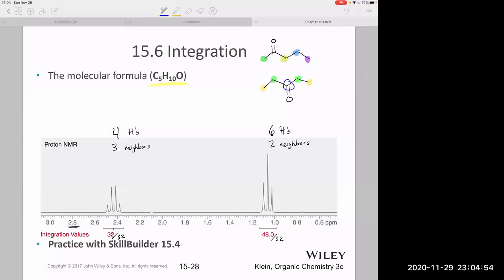Because this is proton NMR, and that carbon doesn't have a proton, right? If we were talking about carbon NMR, all of a sudden I can't ignore that carbon at all. If we were talking about C13 NMR, I would expect 3 peaks for this signal, but we're talking about hydrogen NMR. So I'm going to ignore carbons that don't have a hydrogen. So right off the bat, that points to this one here because we only have our 2 chemically distinct sets of peaks.